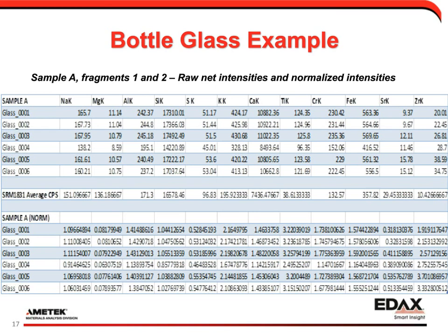Once you've normalized those values, you can use them for future comparison among other labs. Of course, if comparisons were kept exclusively to a single laboratory setting, perhaps this might not be required, but I took that step anyway.